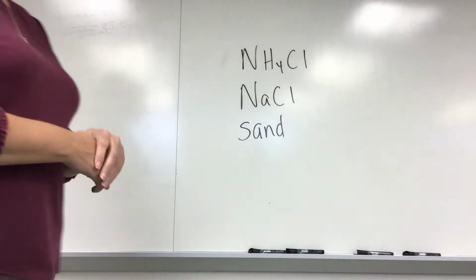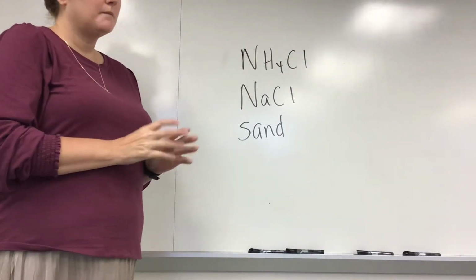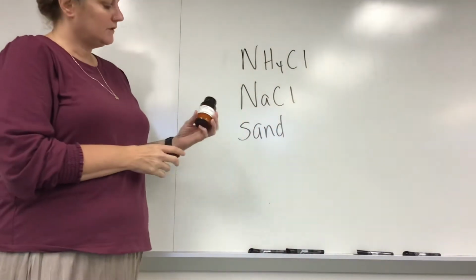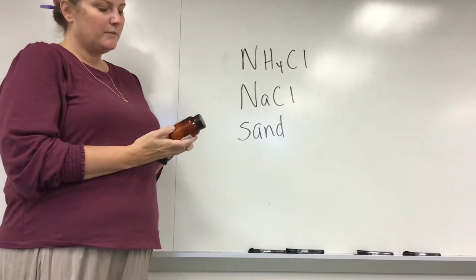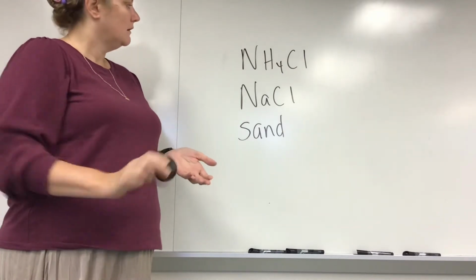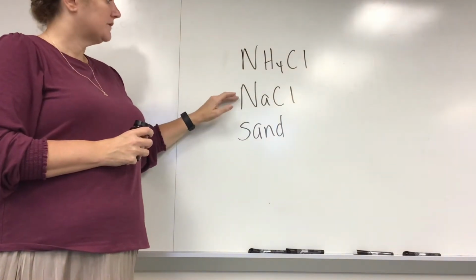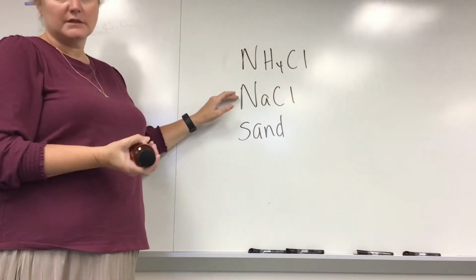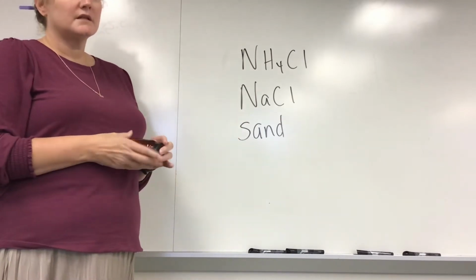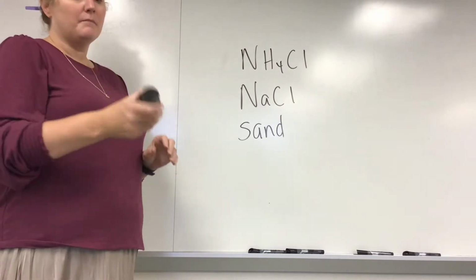Alright, so today we're doing experiment 4 and we would like to separate an unknown mixture. Here is our unknown mixture, and it is made up of 3 different components. The first one is ammonium chloride, sodium chloride, which is table salt, and then we also have sand. The goal of today's experiment is to figure out the percentage of each one that makes up our sample.